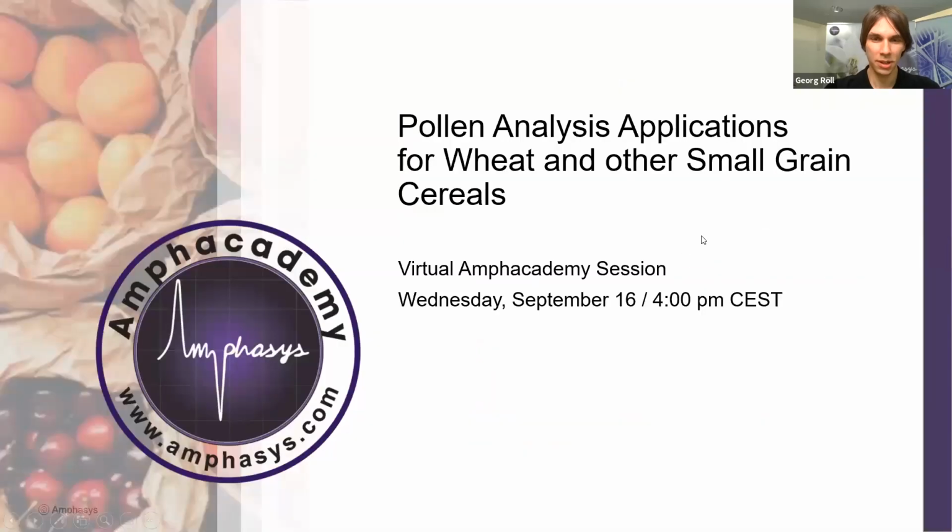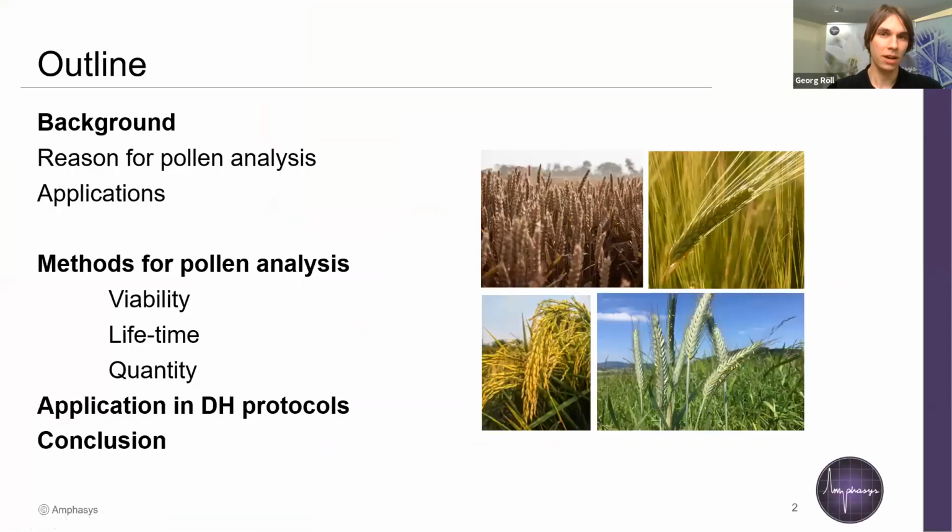So hello everybody and welcome, and I'm really happy to give you a presentation about pollen analysis application for wheat and other small grain cereals. I want to start with an outline. At first we want to talk about the background, the reason for pollen analysis, some applications. Then we will talk about methods for pollen analysis, for pollen viability, lifetime and quantity. And then we will head over to the application in DH protocols. And finally, we will sum up the main points with the conclusion.